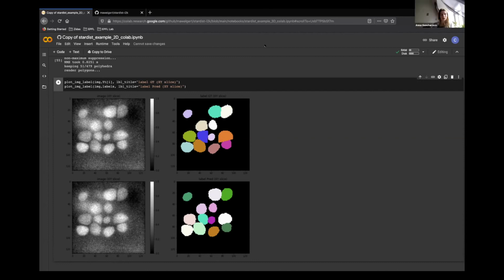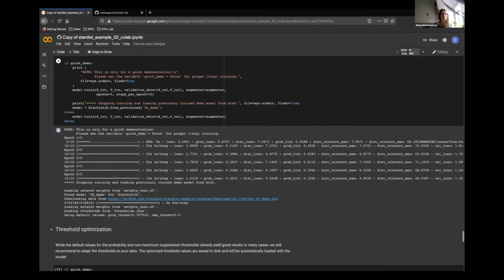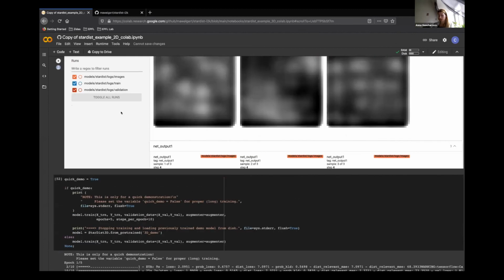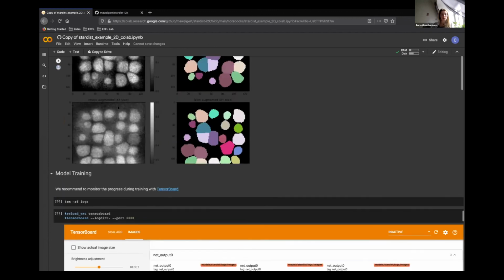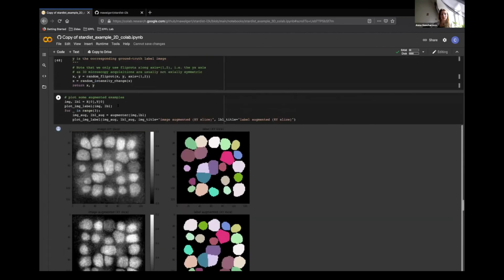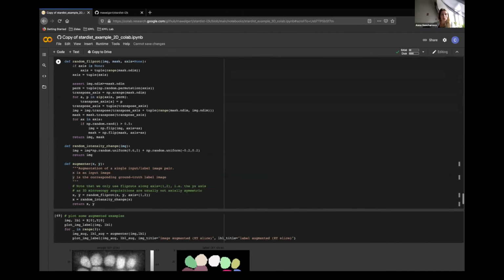But can it cause a very long time for prediction? Because I tried my model and I figured out that there are some difficult cells. And for prediction, even with GPU, it took me a very long time and I didn't get results in an understandable time. Can that be the problem? Can you show me some of those images? Yeah, I can show.